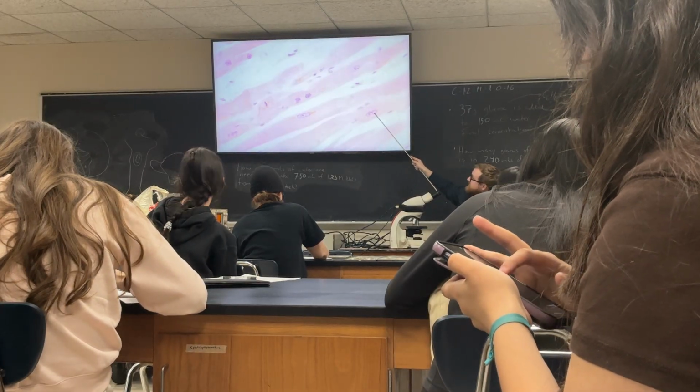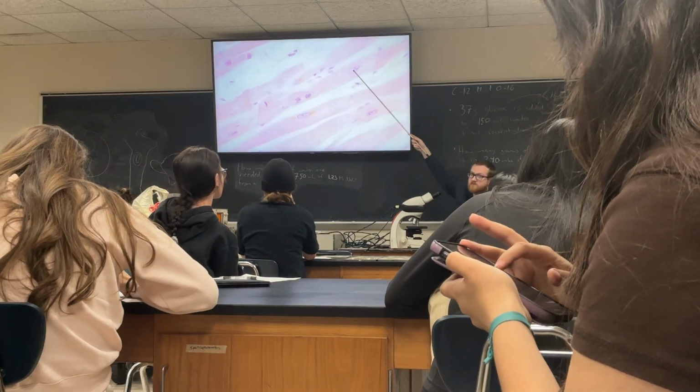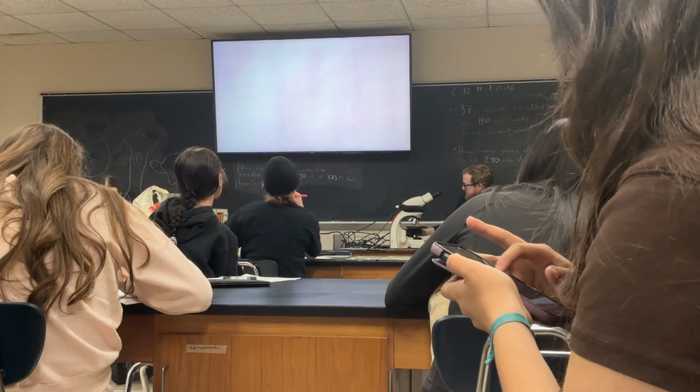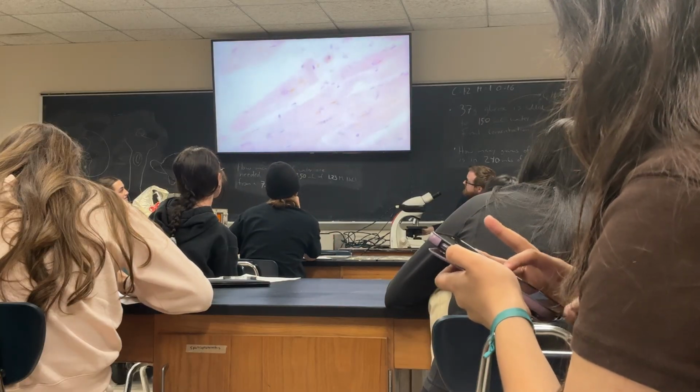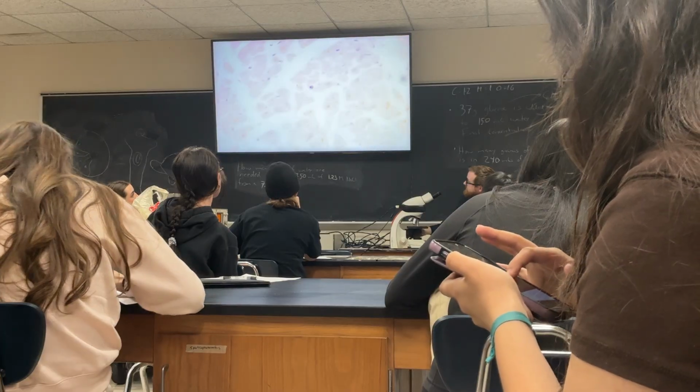Whereas this is cardiac muscle because I see massive cells in the middle and I see clearings around them. That's a really good sign that this is cardiac muscle. If I'm wrong, that would be crazy. This slide's supposed to have all three muscle types on it.